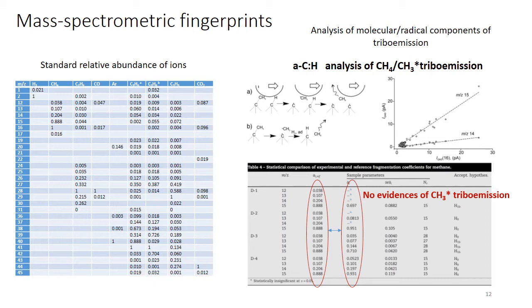This is quite clear from the chemical point of view, since methyl radical is very active, and when it finds some neighbor molecule, it can abstract hydrogen, and so it will complete its configuration and will form a methane molecule. This is why we can only observe methane in the spectrum of the emitted gases when rubbing carbon coatings.